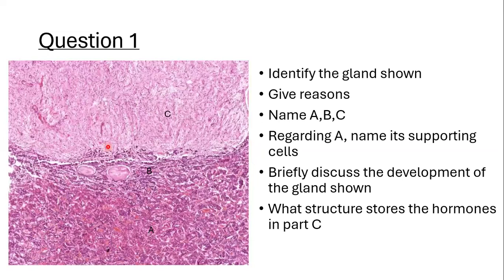Which gland do you think this is? I'm waiting for your responses. Martin will answer your question after you have answered the question. Which gland do you think that is for question one? Just put your answer in the chat box. Pituitary. Okay, I can see most of you are able to identify it correctly.